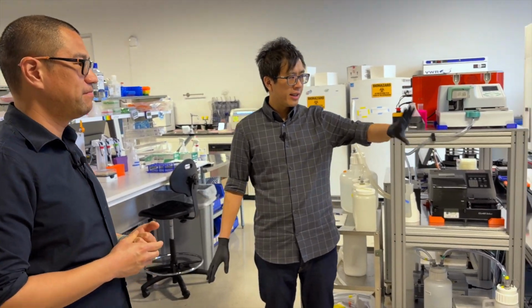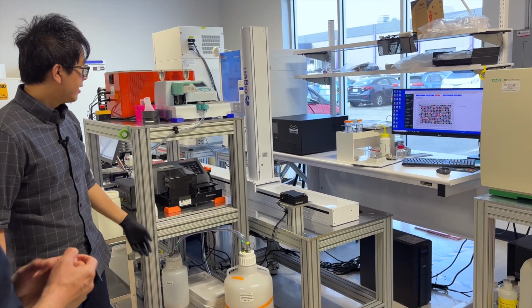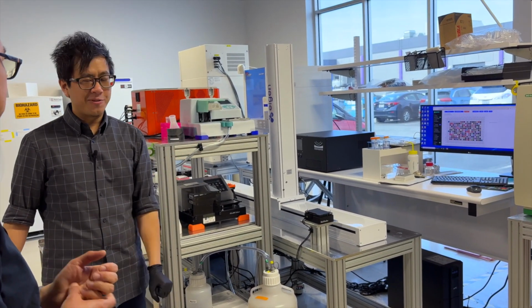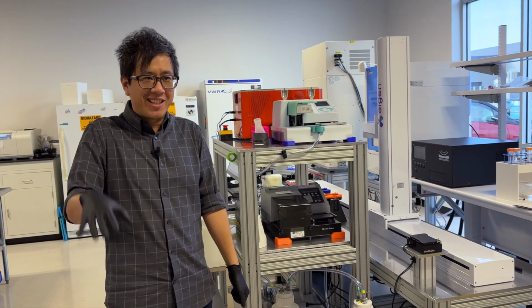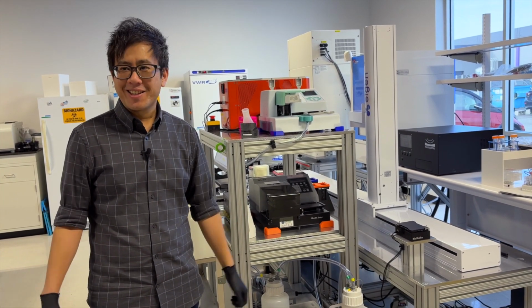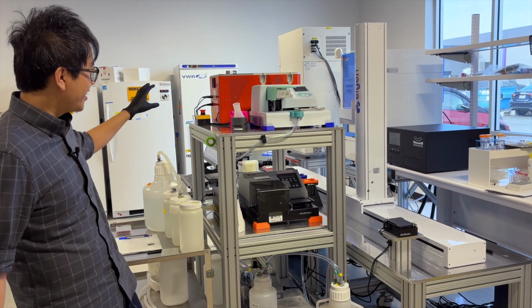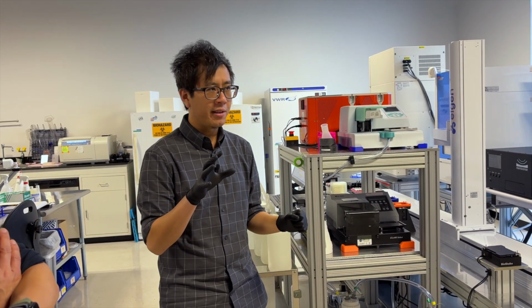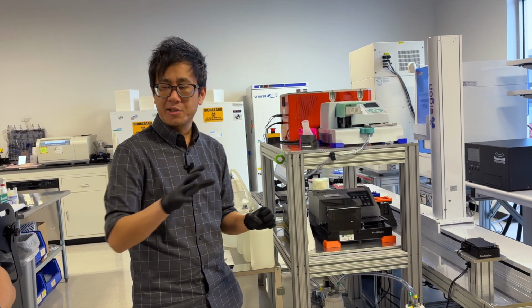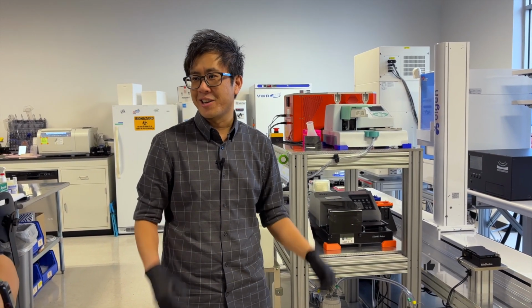So as we start talking a little more about integration, this is the area that is a little more automated. So this would be our integrated work cell. Most of the time when people think about robotics and automation, they think about the robot arm. It's kind of the classic idea of automation. I've got a robot moving plates around. I mean, the robot arm is cool, but what I'm really interested in is all these different instruments that themselves do a very important job in the process. The robot arm is really the broker, right? Whose job is to carry plates from instrument to instrument as each instrument does some kind of perturbation.